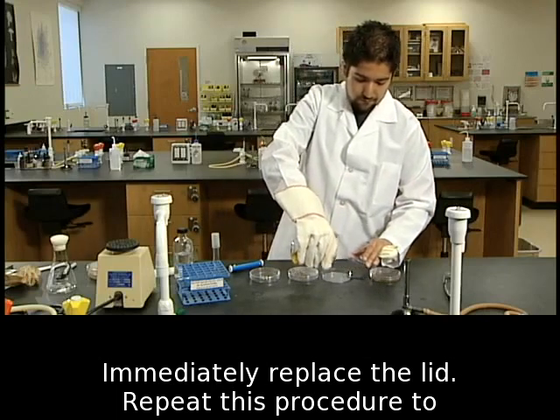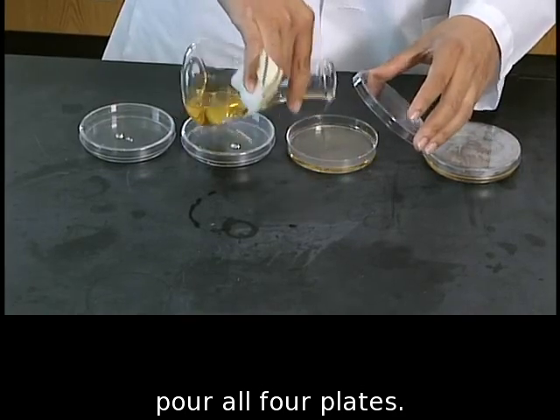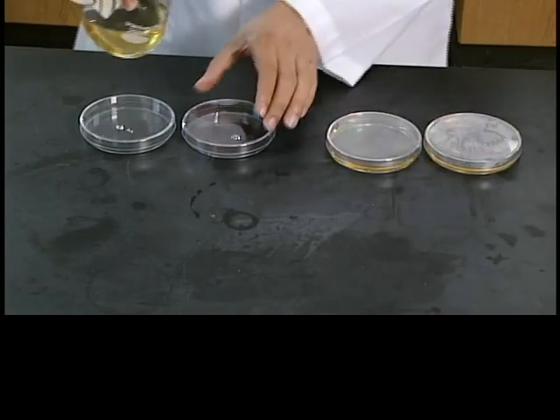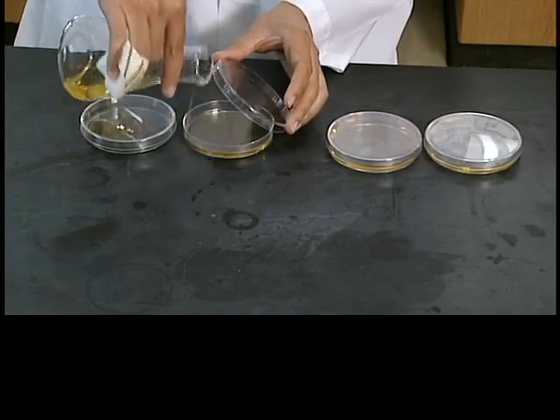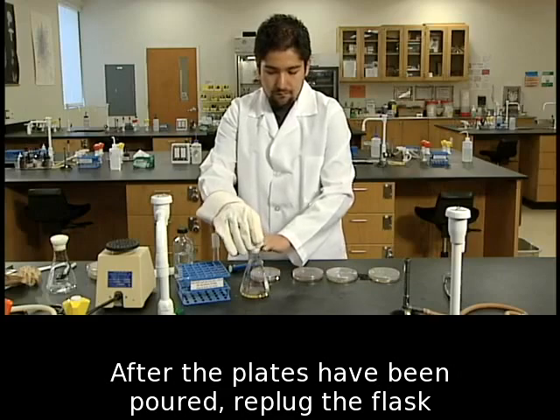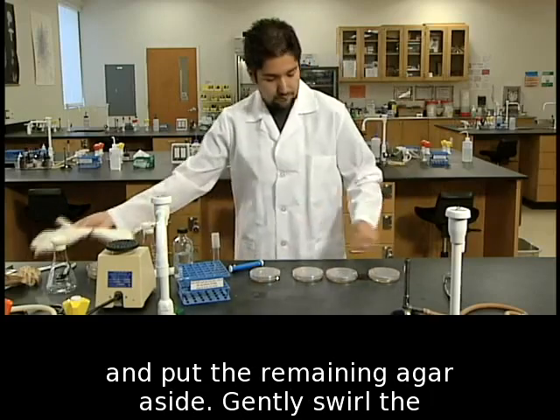Repeat this procedure to pour all 4 plates. After the plates have been poured, replug the flask and put the remaining agar aside.